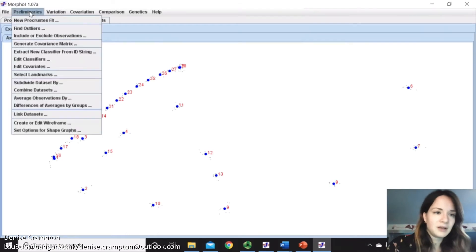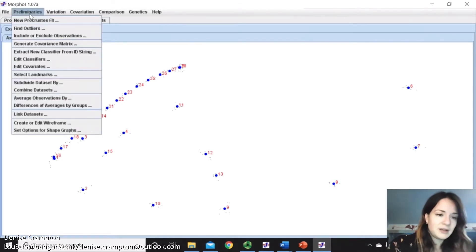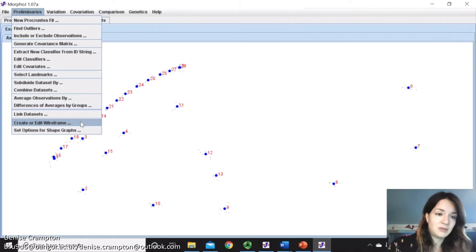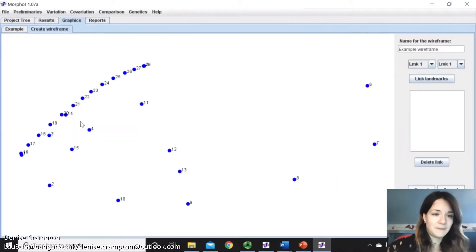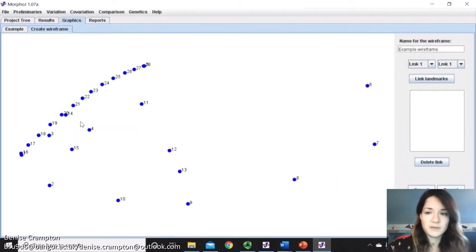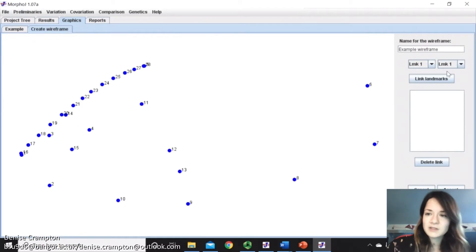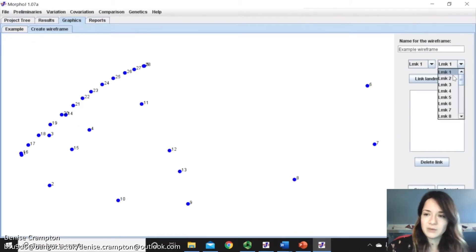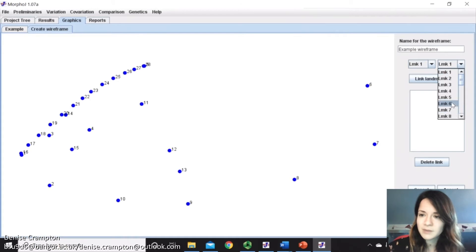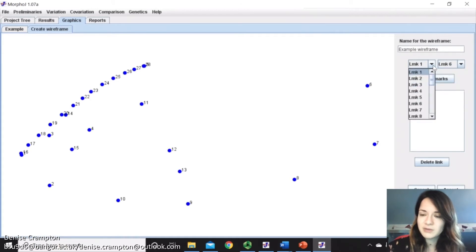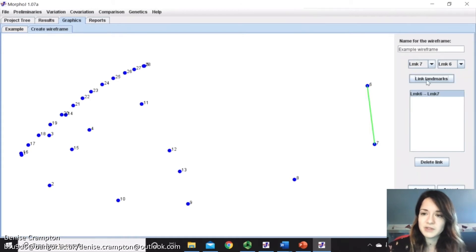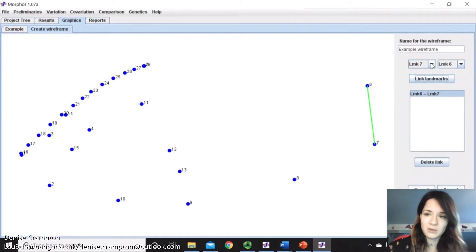But before we do that, it's good to create a wireframe, which is a way of visualizing the results. You don't need to do this, but it will be a nice way of presenting your data. So all you have to do is link the landmarks and it will create a link between them. In general, you'll do this along biological features, but it's entirely up to you on which ones you think will look the best.